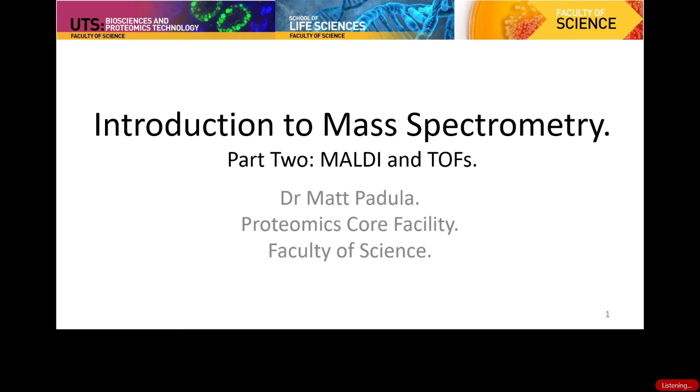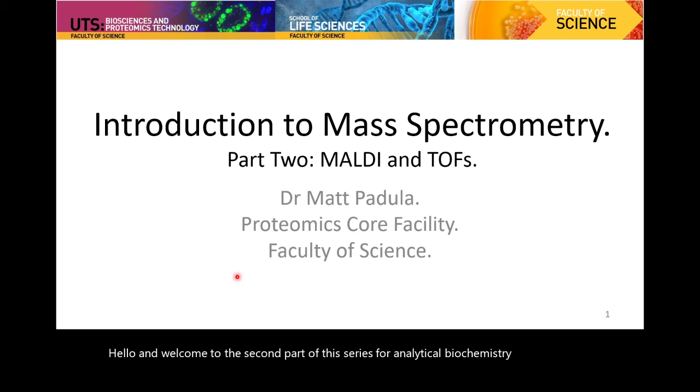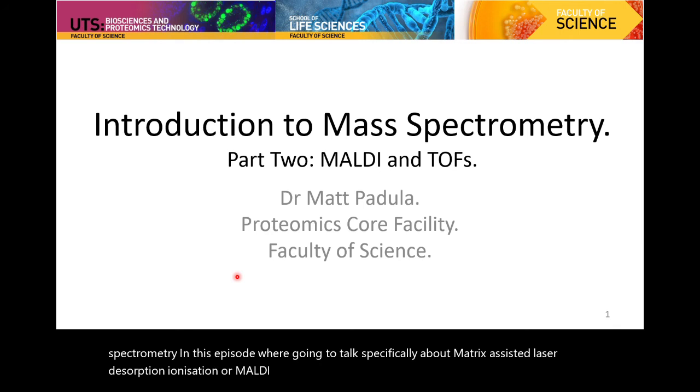Hello and welcome to the second part of this series for analytical biochemistry about mass spectrometry. In this episode, we're going to talk specifically about matrix-assisted laser desorption ionization, or MALDI, and time-of-flight detectors, because they are the most common things that are put together.